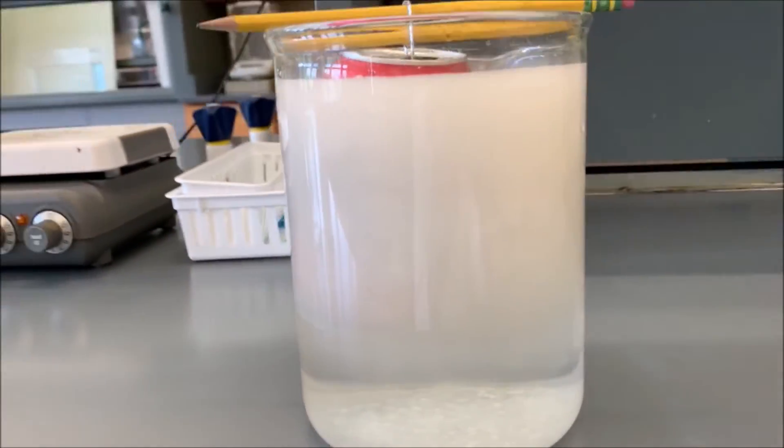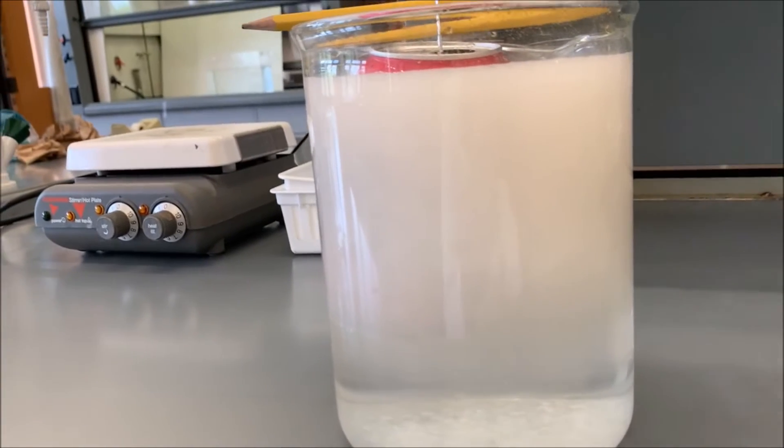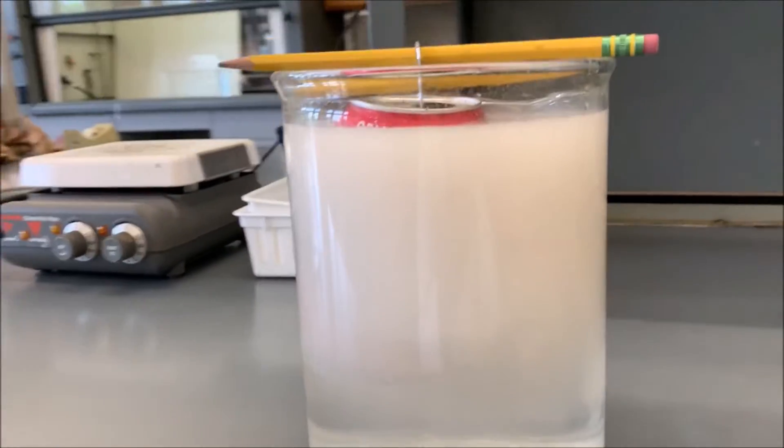It's about 30 minutes for that reaction to completely dissolve away all of the aluminum on the exterior of the can. We're about to head into the lab — it's been about an hour. Let's see what the reaction looks like.